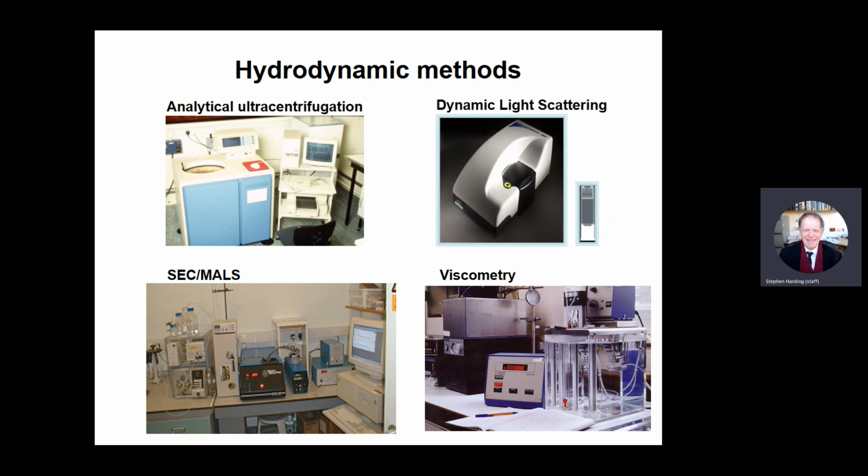That being said, the software now is very good at filtering away the contributions from large supramolecular aggregates, which can obscure the light scattering signal from your molecules.